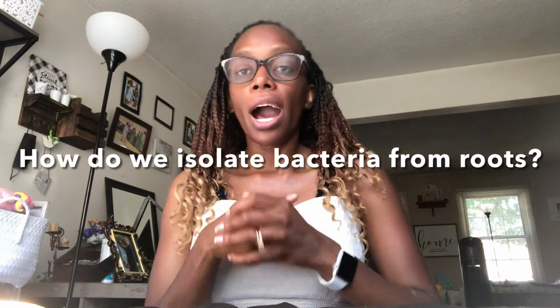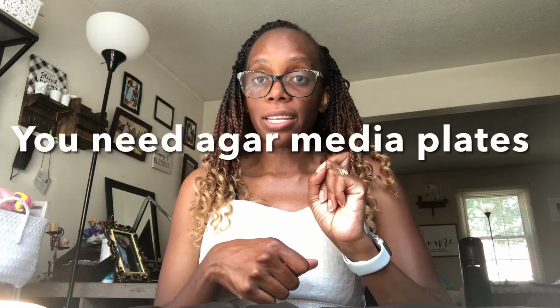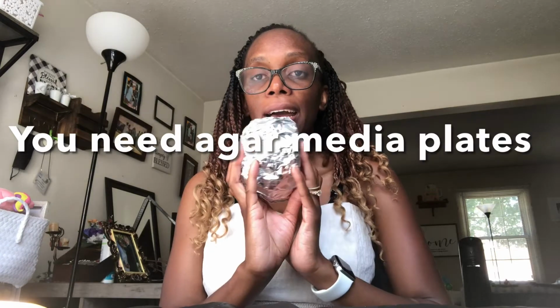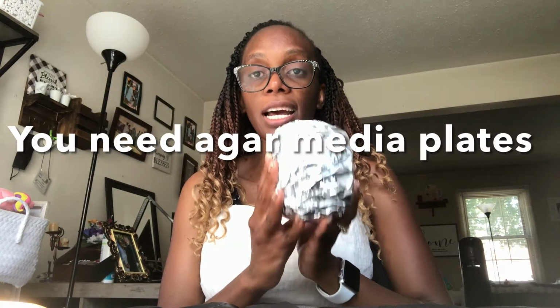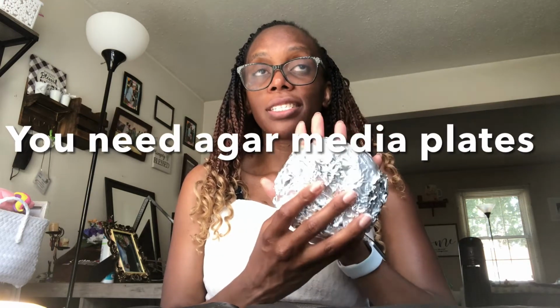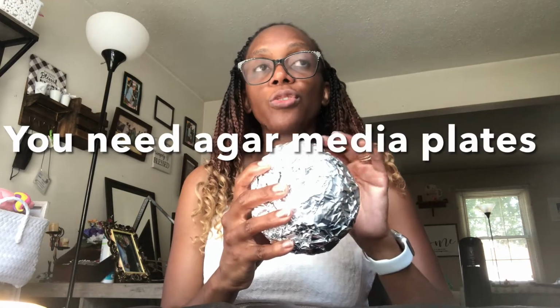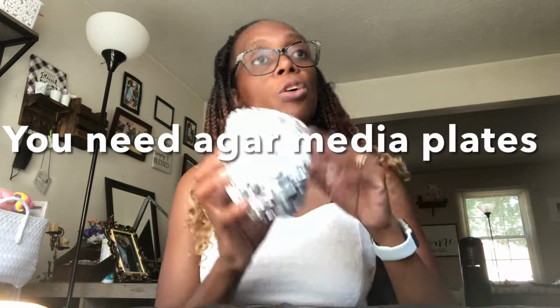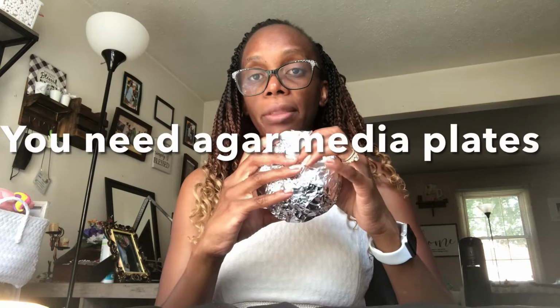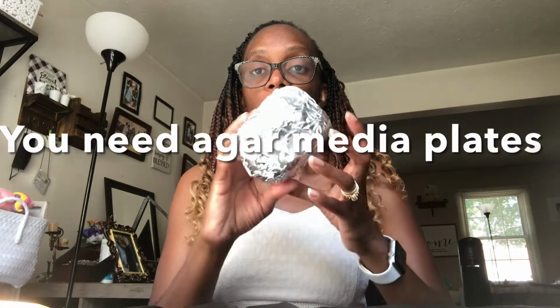Okay, so how do we isolate bacteria from our roots? What do you need? First of all, you're going to need agar plates that have media. Media is essentially a jelly that has different chemicals that are perfect nutrients for bacteria to grow, or fungi, in general microorganisms. There are different types of media, which we'll talk about in the next class. So you have this particular one. Remember, you kept this in the refrigerator, so you need to take that out.